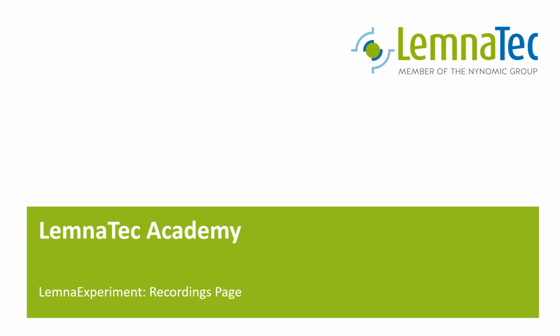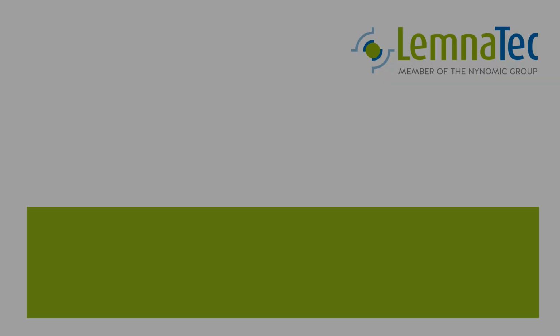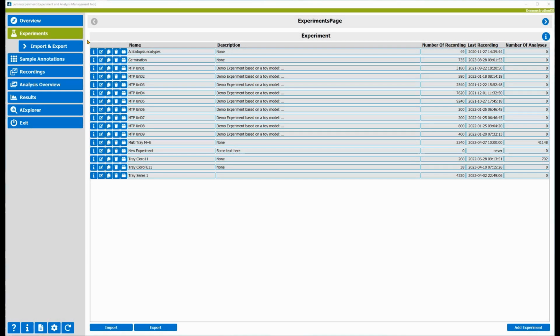In this video, we will continue with our deeper look into LemnaExperiment. The recordings page is one of the central parts of LemnaExperiment. You see here all your recordings and images in a systematic presentation. Now, let's move to the recordings page.